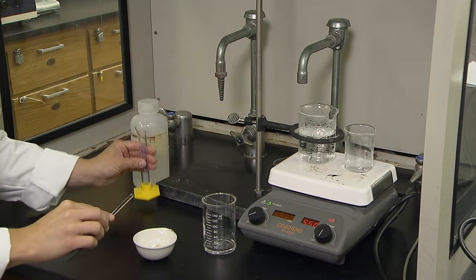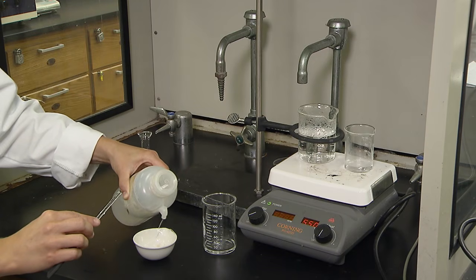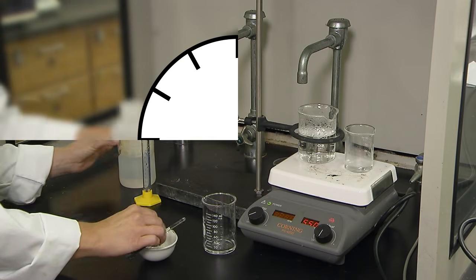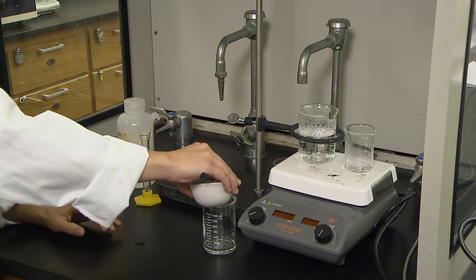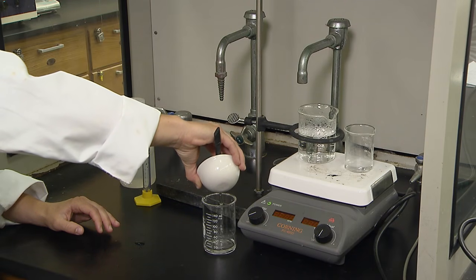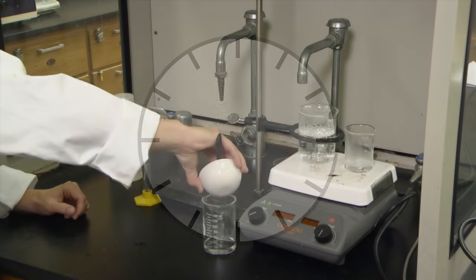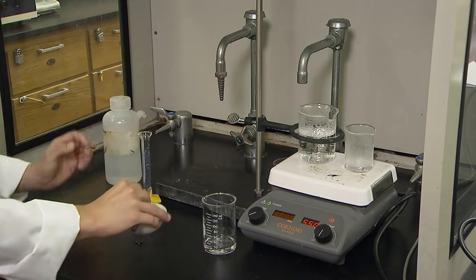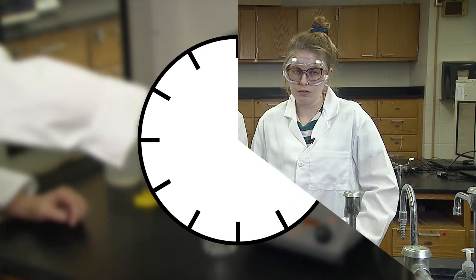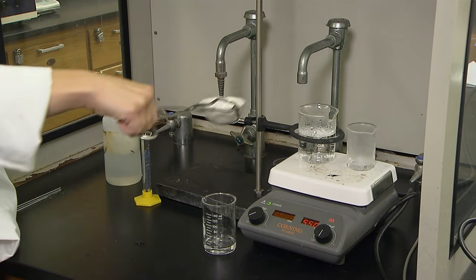We want to be sure to wash all the remaining solids, so we add around 5 milliliters of water. Allow the solid to settle again and decant in beaker 1, adding to the original solution. Wash an additional 2 times for a total of 3 washes and collect all liquid in beaker 1. We can now use the water bath to dry the solid in the evaporating dish. Use crucible tongs like a tweezer to move the evaporating dish.